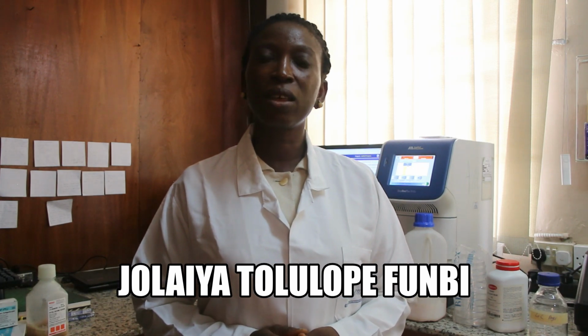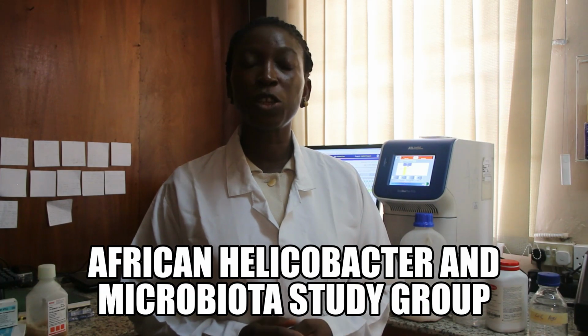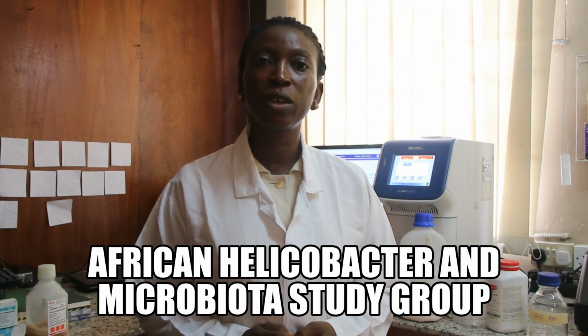I'm presenting this video on behalf of the African Helicobacter Microbiota Study Group to have a standard operating procedure on the culture, isolation and susceptibility testing of Helicobacter pylori. Helicobacter pylori is a microaerophilic gram-negative organism. When we talk about a microaerophilic organism, it means that this organism requires a low level of oxygen to grow optimally.